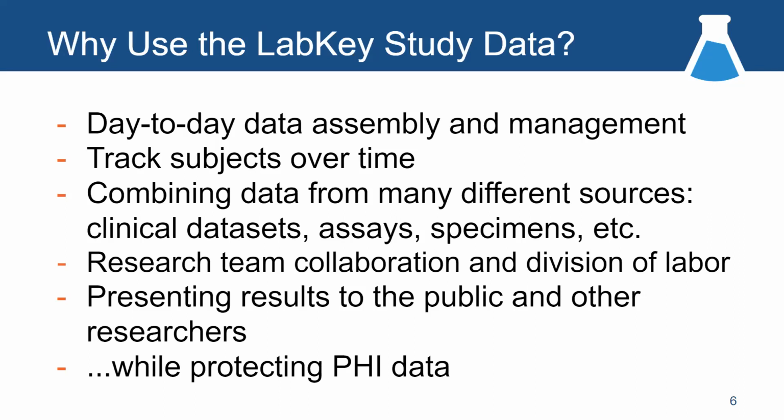And it's also great at protecting PHI and PII data. And we're gonna look at that at the end. How can you make sure that you're sharing just that sliver of data that you want to share and holding back that data you don't want to share, like people's names, people's addresses, etc. So these are all great reasons to use LabKey.